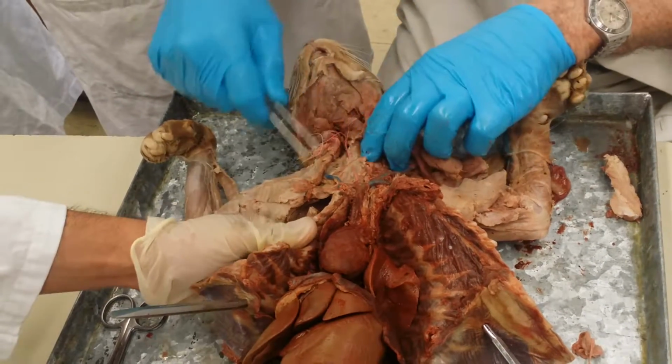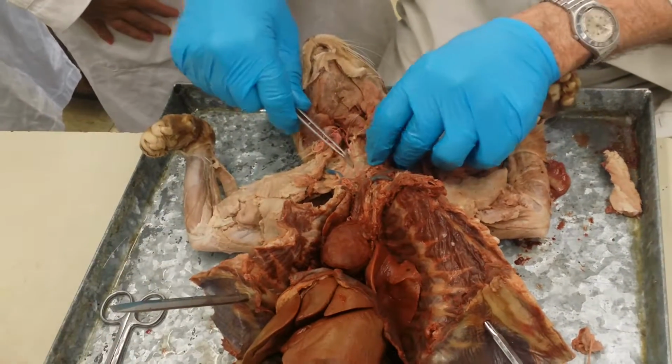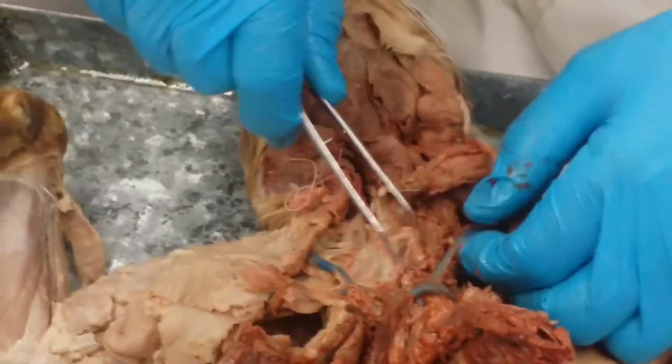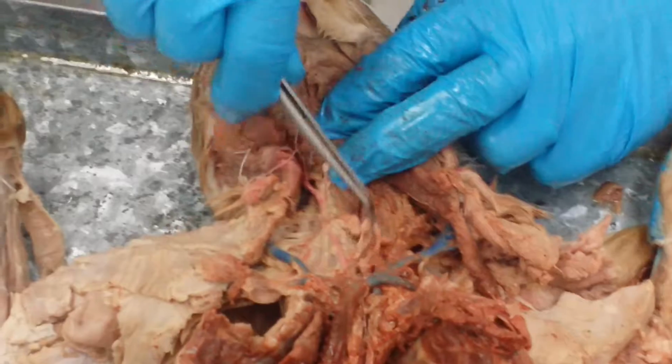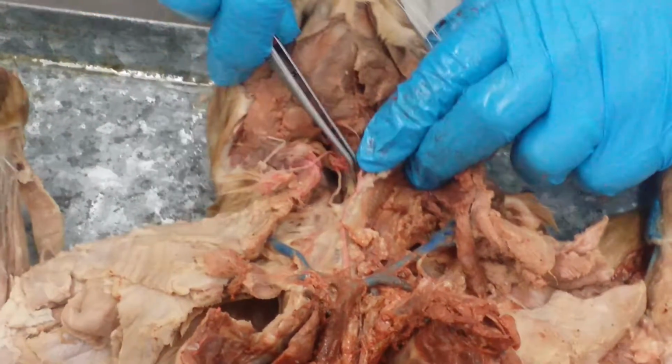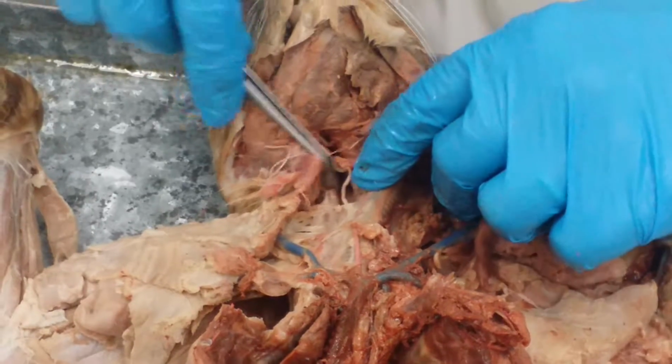The common carotids come up and pass generally parallel to the trachea. Now, did this one have a crossover?